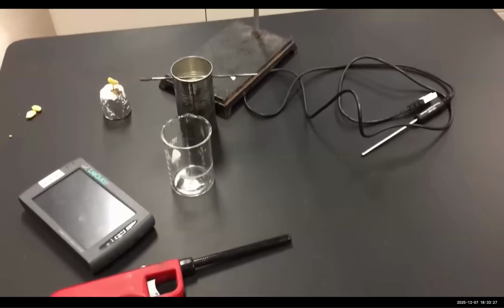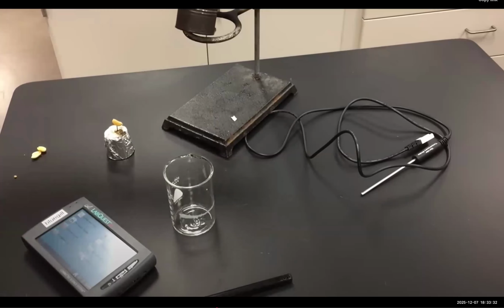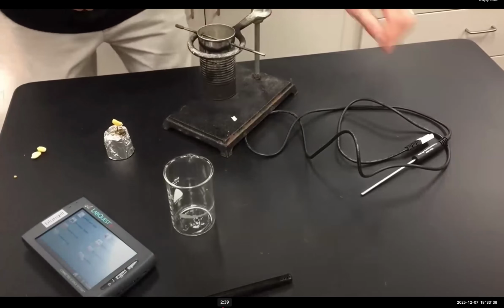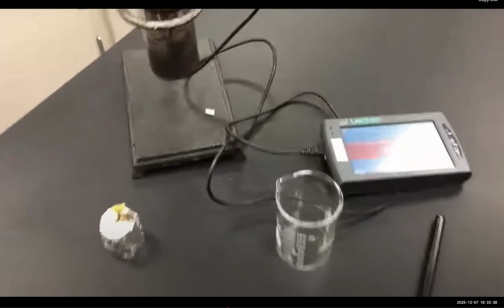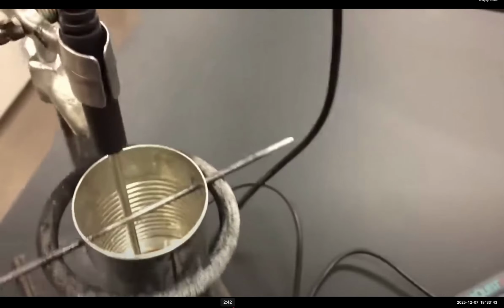Okay. Now for what I would consider the fun part. I'm going to set up the calorimeter and prepare it for heating. We've set up the temperature probe that's in the water inside the calorimeter.